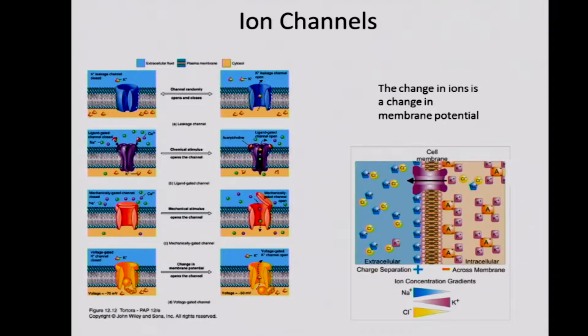Fortunately, there are ion channels. Now, these are protein structures embedded in the phospholipid membrane. This shouldn't be new material for you guys, but if you have questions, don't hesitate to ask. And these are going to allow a permeability of these charged particles through the phospholipid bilayer, which generally does not allow for the diffusion of particles. Some of these channels are just opening and closing at particular rates, some on, some off, allowing for passive movement of the molecules through it.